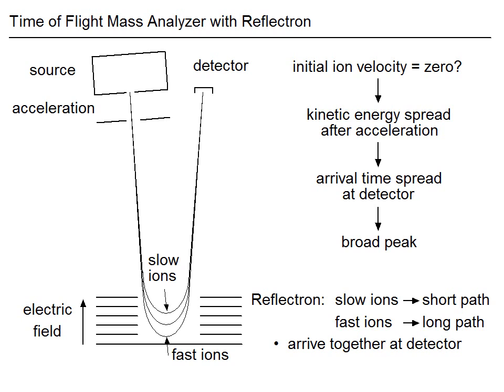Possibly the most important improvement of the time of flight mass analyzer was the Reflectron. Why do you need a Reflectron to get high resolution in a time of flight mass analyzer? The reason is that the initial kinetic energy of ions is not exactly the same. This can be easily understood if you imagine a laser hitting the target and generating a cloud of ions at high energy. Not all the ions are at the same place, so the acceleration voltage will be slightly different for these different ions due to the different distances to the opposite charge plate.